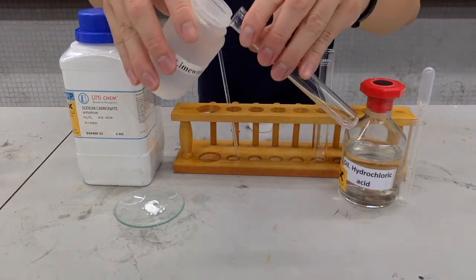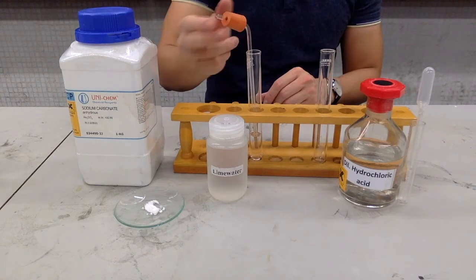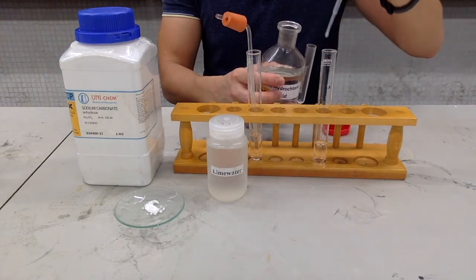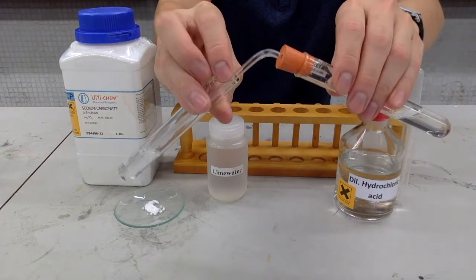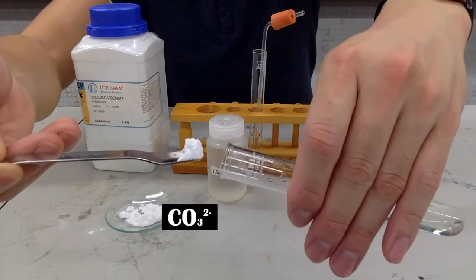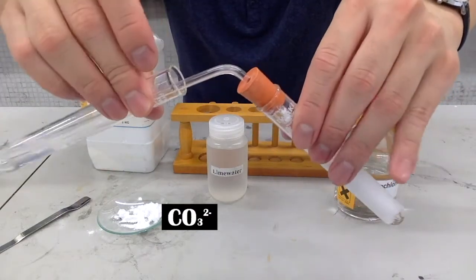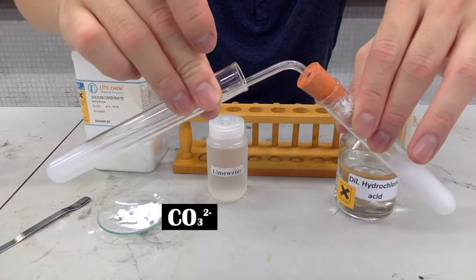Pour lime water into a test tube. Place a delivery tubing into the test tube containing lime water. Pour hydrochloric acid into a test tube. Check whether the rubber bung of the delivery tubing can fit into the test tube containing dilute hydrochloric acid. Transfer the sample containing carbonate into a test tube with dilute hydrochloric acid. Connect the delivery tubing. Drop the carbonate into the hydrochloric acid. Bubbling occurs in the hydrochloric acid and the lime water turns milky.